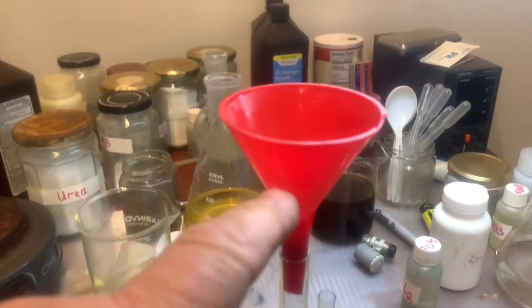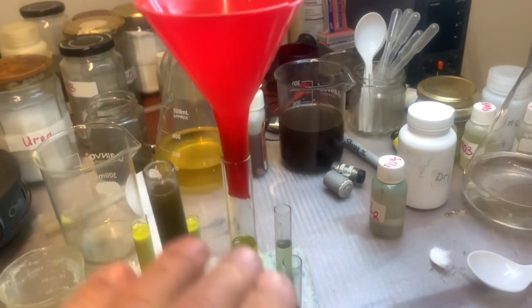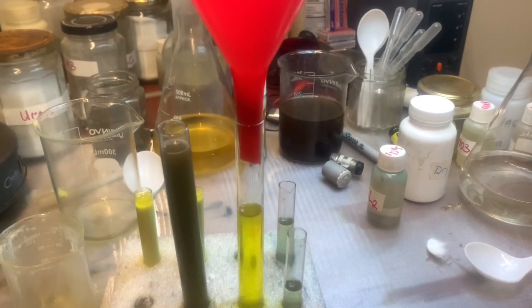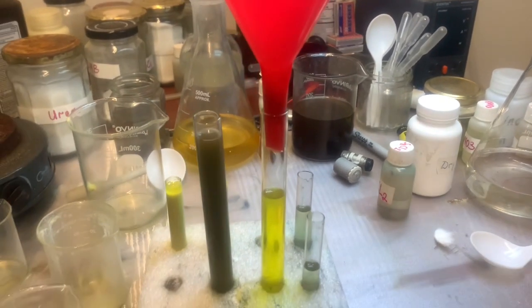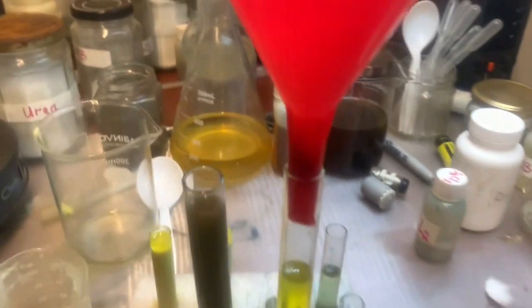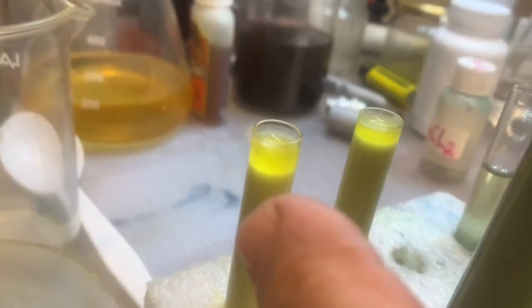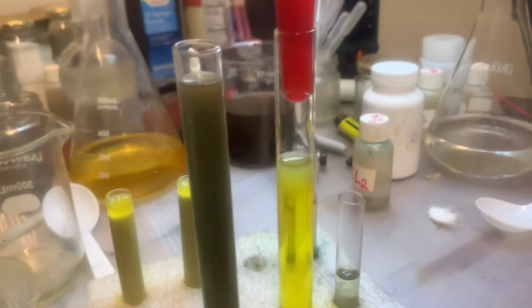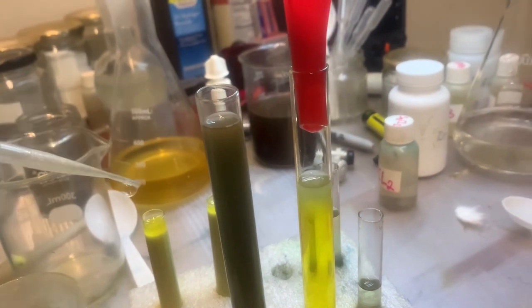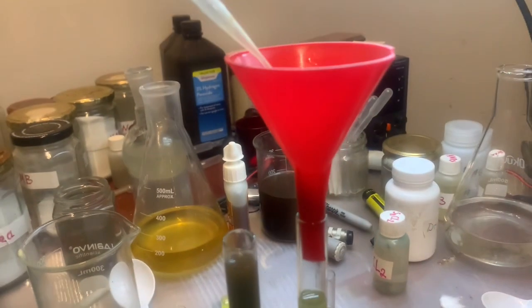Okay. So I put some SMB on the top in the filter. The filter washes a little bit of all that juice. What is left there? And then add the rest in there. And I'll be washing the filter too. And over here, already getting a little bit more. I can take that one from here. Okay, a little bit here.